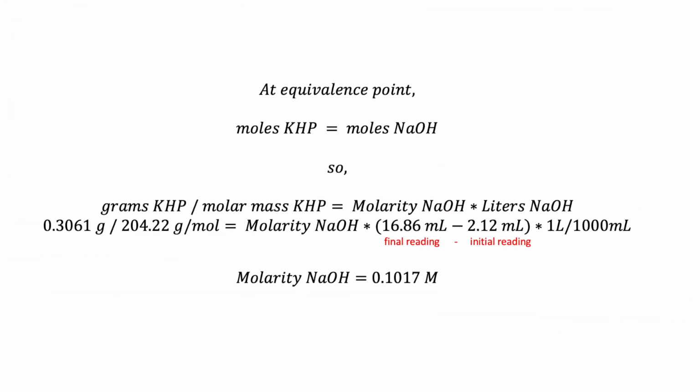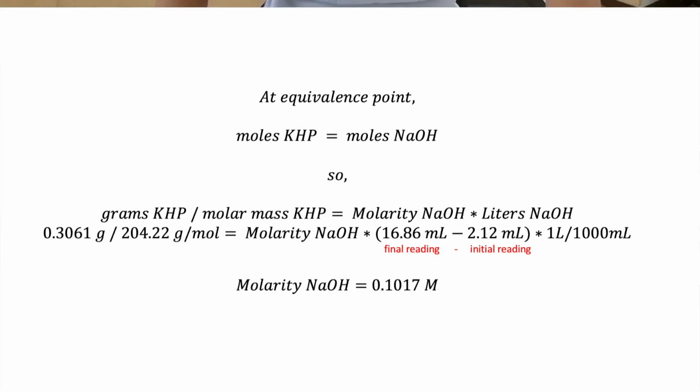With the final volume of the sodium hydroxide, I could now subtract the initial value and then get the total volume used of base. Since I know the moles of the acid used, I could now calculate for one trial of the concentration. Again, I need to do this 2 more times so that I could establish reliability.